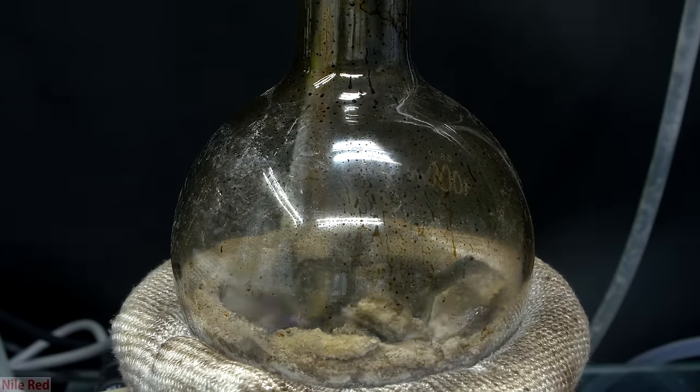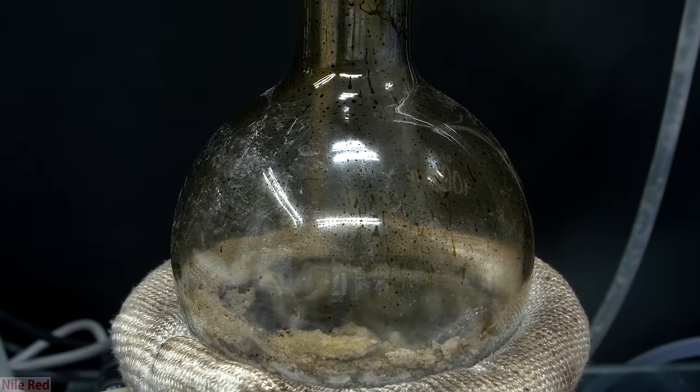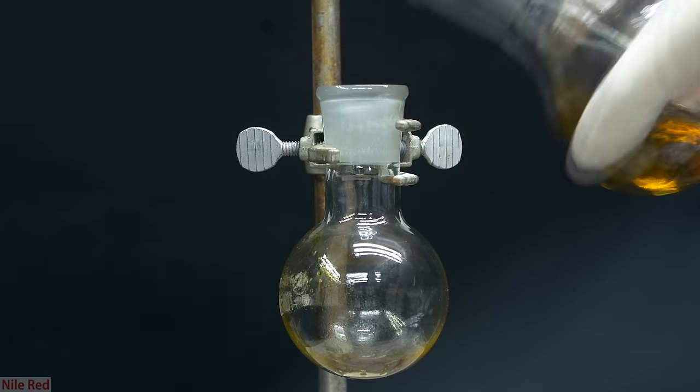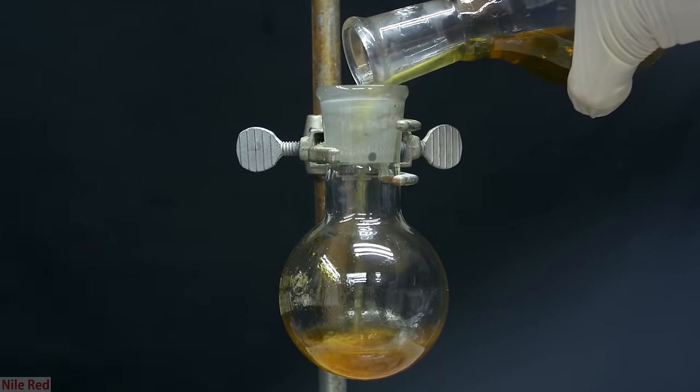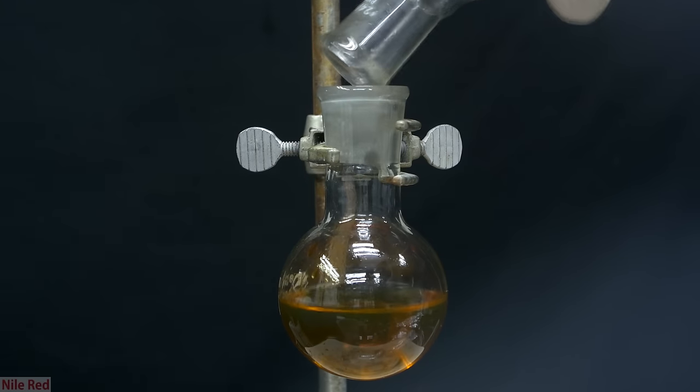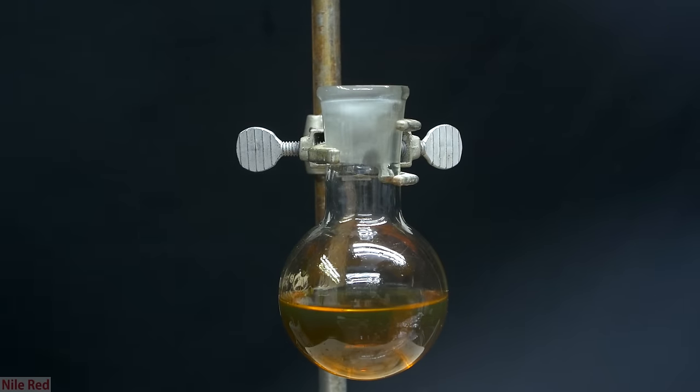Today we're going to be making a little bit of acetone using calcium acetate that I made in a previous video. The procedure is pretty straightforward, and we effectively just need to heat up the calcium acetate, and it will eventually break down to form calcium carbonate and acetone.